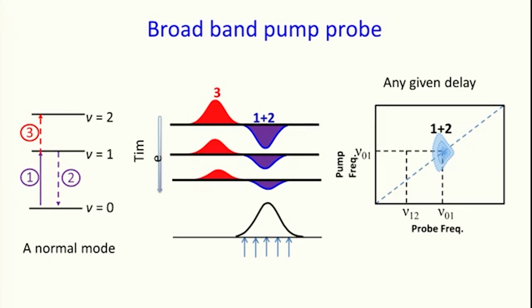denoted by 2. Okay. So, we get a 3-dimensional surface, and at nu 12, at the intersection of nu 01 pump and nu 12 probe, we get a similar signal but positive. Okay. What is the difference between the maximum point in the positive signal and the negative signal? Not very difficult to see, from here to here, the difference in frequencies.